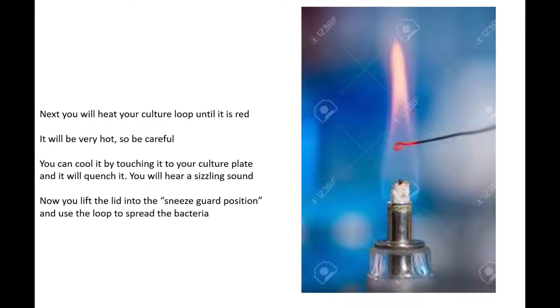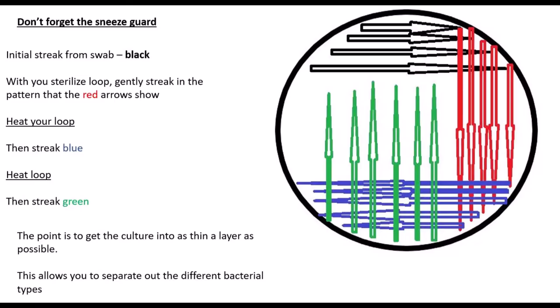Now you've spread your initial sample out and I'll show you exactly how in just a minute. Then you're going to have to heat your culture loop up until it is really, really, really hot. When it's red, it is hot. Then you're going to lift your plate up, your agar plate, in sneeze guard fashion and touch that hot blistering hot loop to a part that's not been inoculated yet. It'll quench it and it won't be too hot to kill your bacteria. You'll hear a little [sound], it's a very satisfying sound. I keep scaring my cat every time I do this though.